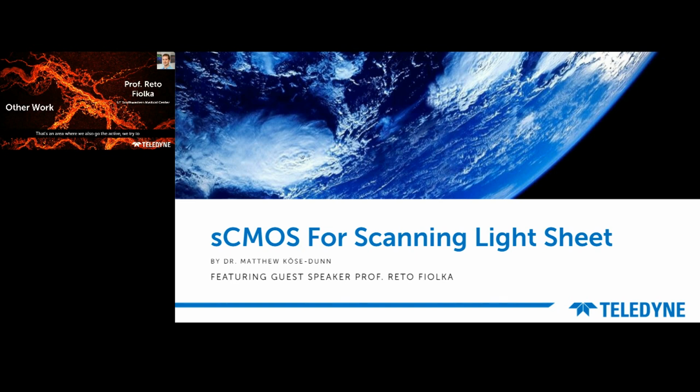That's an area where we also got active. We also try to combine light sheet microscopy with structured illumination microscopy, or SIM for short. SIM is a technique that can double the resolution of a wide field microscope in a non-phototoxic way. So there we also started a new research avenue.